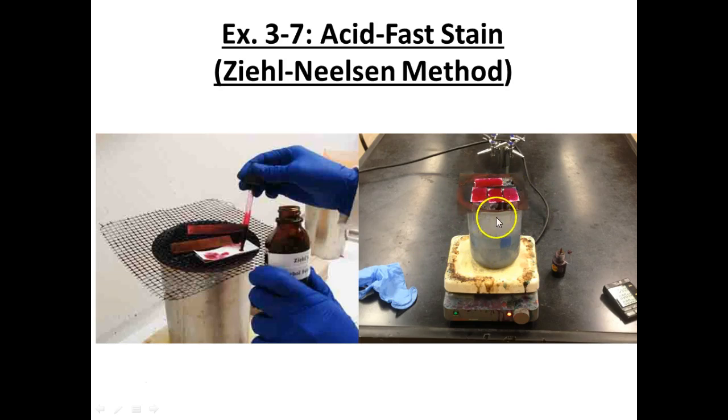And so you're going to place your 4 slides for your lab bench on the screen. We have filter paper that you're going to put on top of the slide. So go slide, filter paper. The reason why I say this is I had someone last semester trying to do it in the opposite order. The reason for the filter paper is to keep the moisture, keep the stain from evaporating quickly.